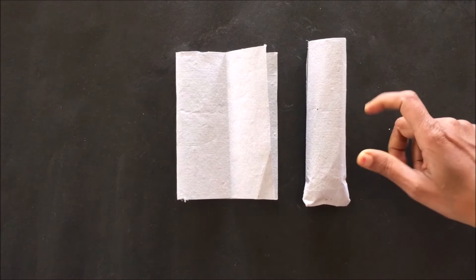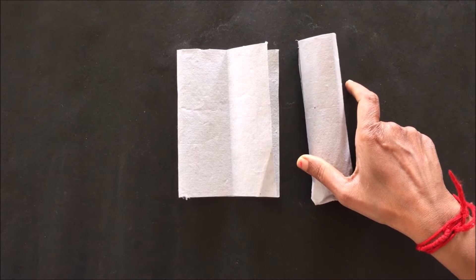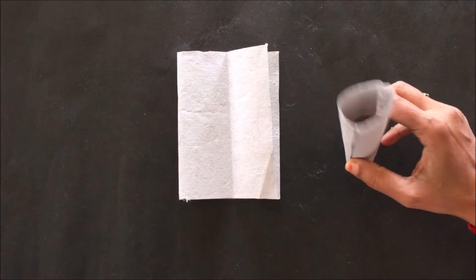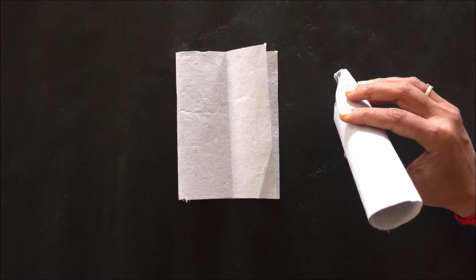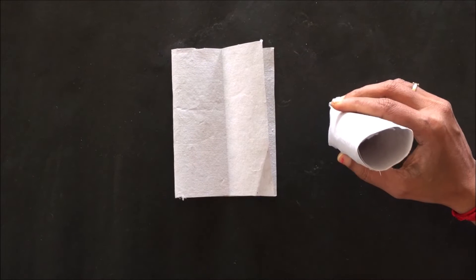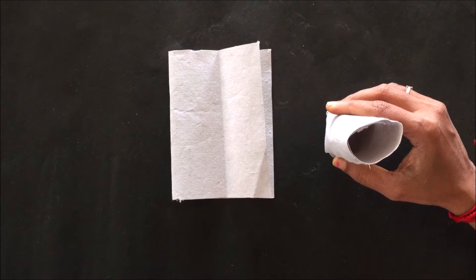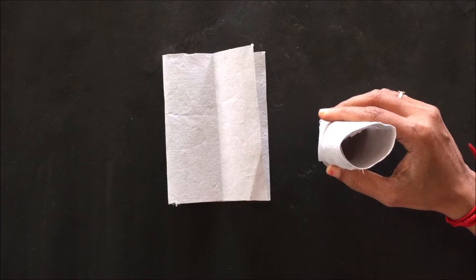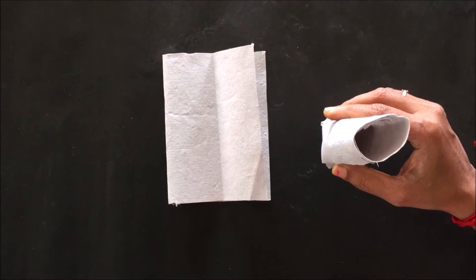The material to be extracted is placed inside this thimble so that during extraction only the solvent containing the plant constituents comes out of the thimble, while the powder drug material remains inside. If we do not use a thimble, the particles of the drug material may choke the narrow siphon tube and disturb the extraction process.